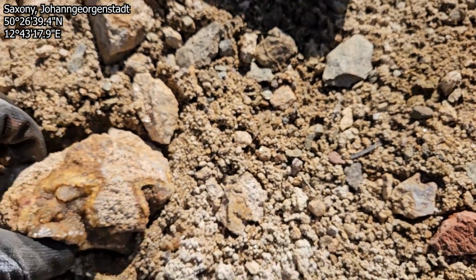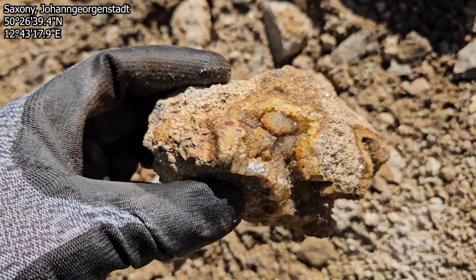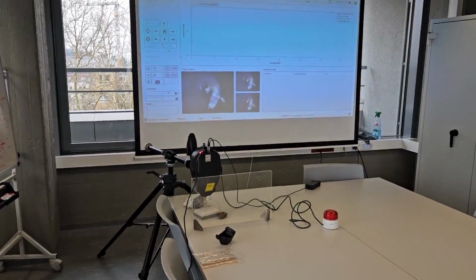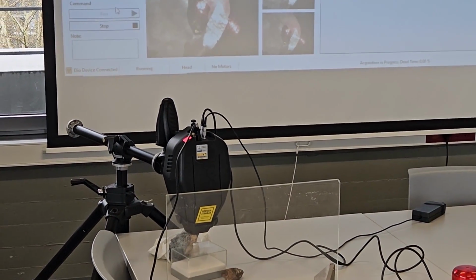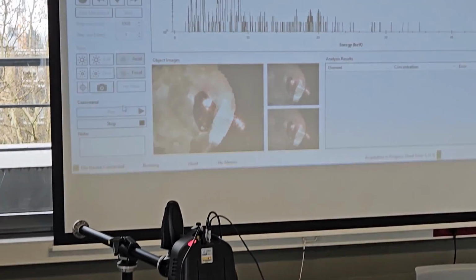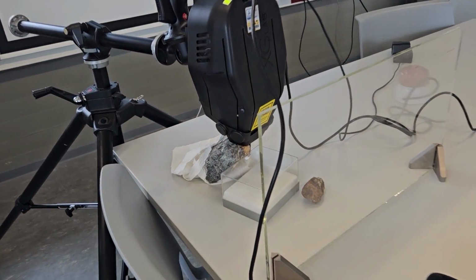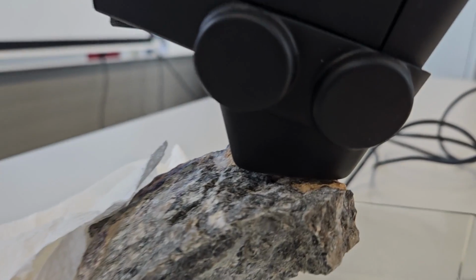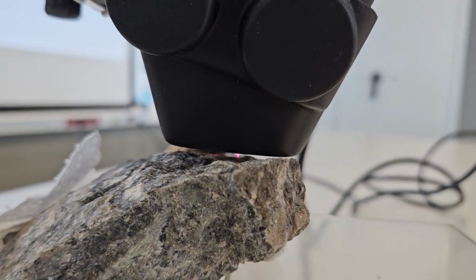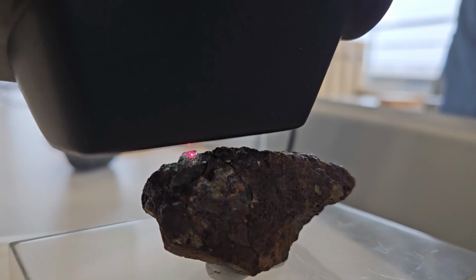After some cleaning etc. we had a very strong suspicion as to what this rainbow mineral might be. But I'm allowed to analyze at the university, and luckily I have received support from Professor Dr. Gregor Starr. He is from the Department of Classics and has a handy X-ray fluorescence camera. Fortunately, it is really easy to use. Point the camera, adjust until the laser points overlap and go behind the radiation shielding. And then just start measuring.